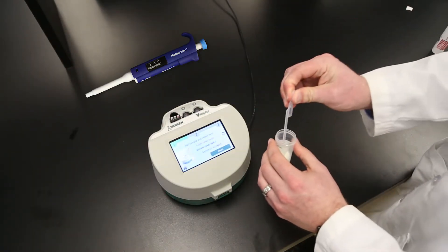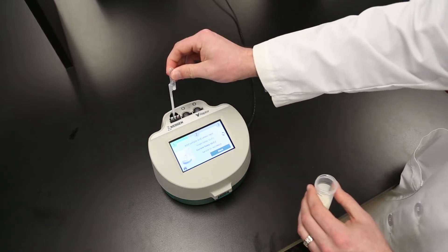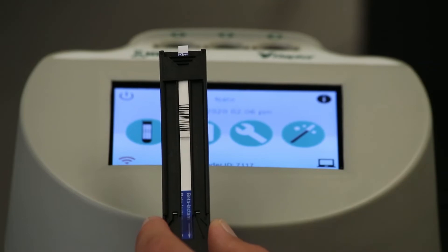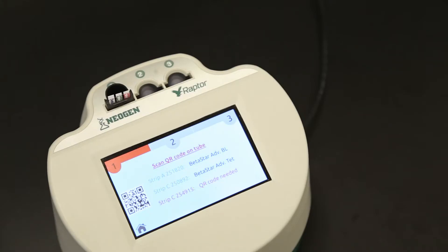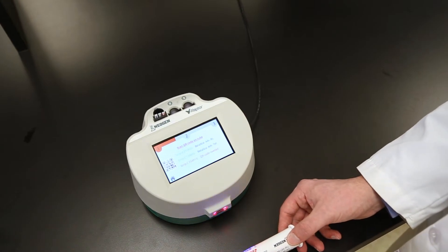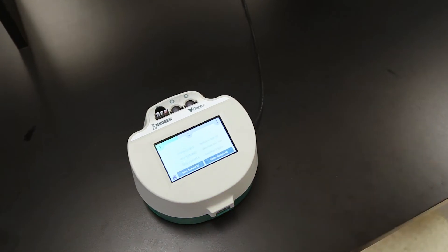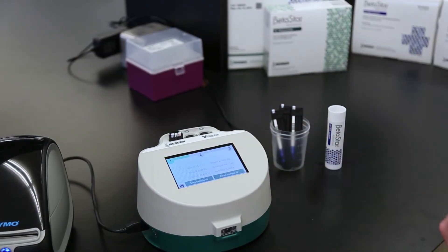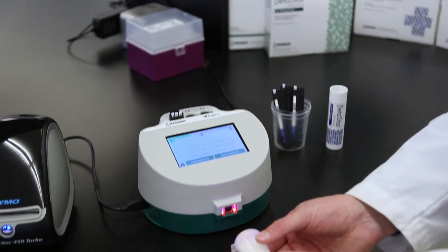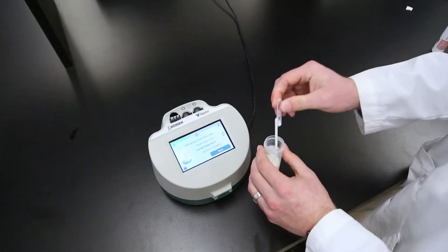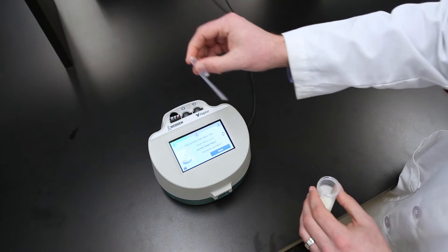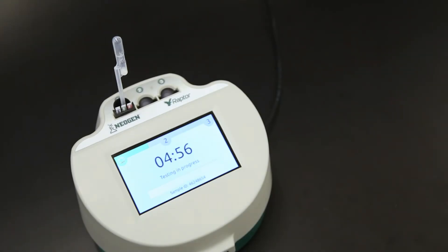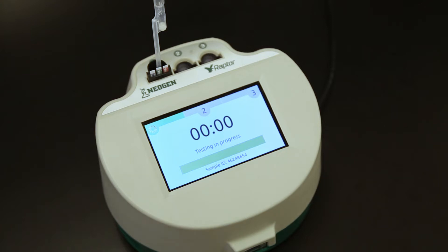The same 400 µL sample volume is used whether running 1, 2, or 3 tests for the milk sample. The Raptor's HD camera automatically scans the test strip's barcode and the lot ID is recognized. If this is the first time the lot is being used, the Raptor prompts the user to scan the QR code on the test strip tube — hold the tube a few inches away and the QR code will be scanned, transferring lot information such as assay type and expiry date. You can either enter a sample ID using the on-screen keyboard or scan a sample ID with an available barcode. After the port reaches 65 degrees Celsius, add the sample and select Next. The Raptor counts down while waiting for fluid front, then starts the 5-minute timer when the sample fluid front is detected. After 5 minutes, the result appears and automatically prints.